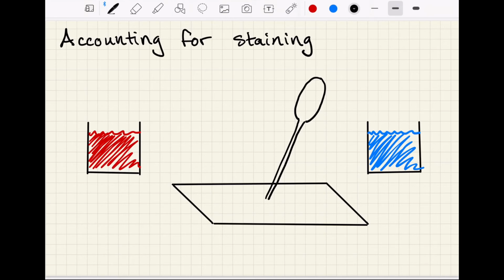One extra layer to this is if you use methylene blue for viability staining. I won't go into the details of doing that staining here, but the idea is that you add methylene blue to your sample and mix them together, and dead yeast cells turn blue while living yeast cells stay colorless. So let's say you mix 1 drop of your sample with 1 drop of the methylene blue stain, then you put that in your hemocytometer. You've now made a dilution of your sample.